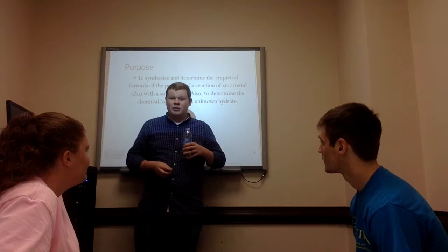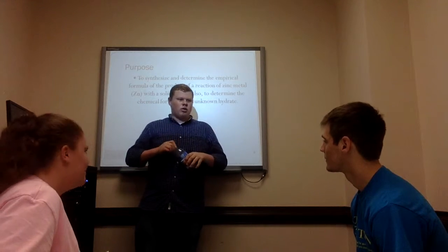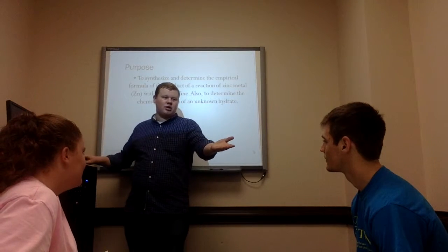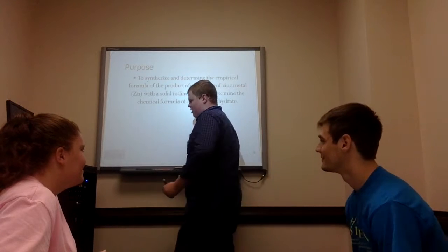Need some dihydrogen monoxide, I'm sorry. Which is what type of bond? Covalent.